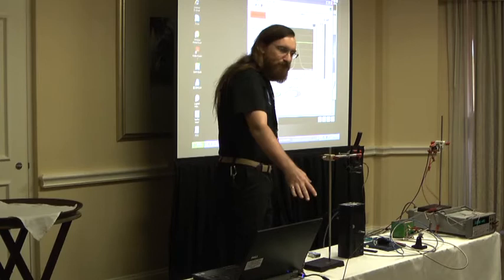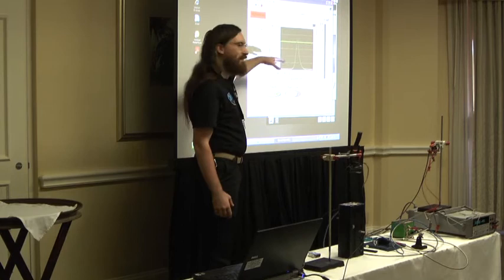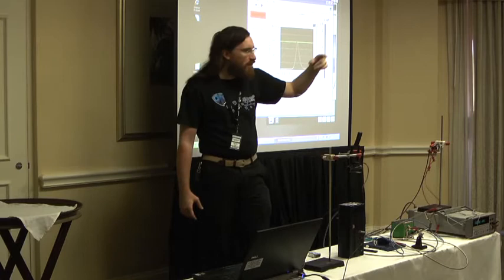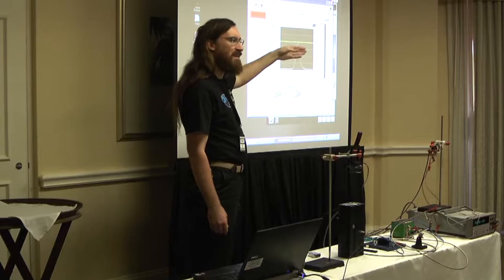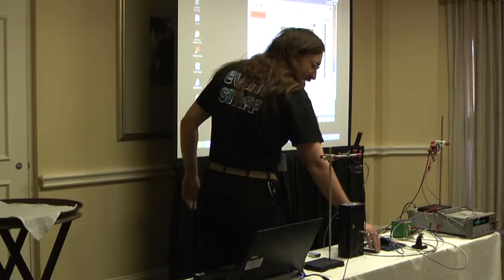This is a LAPI application communicating directly with the Jazz over Ethernet. It is doing two things: first, reading out a spectrum, and then figuring out what gain would be needed on that LED in order to hit a target intensity. It's doing a feedback loop to try to maintain peak intensity right at that green line.